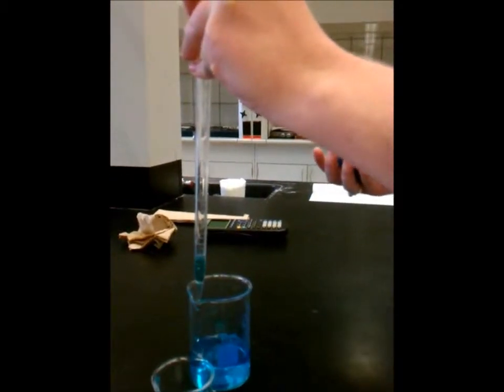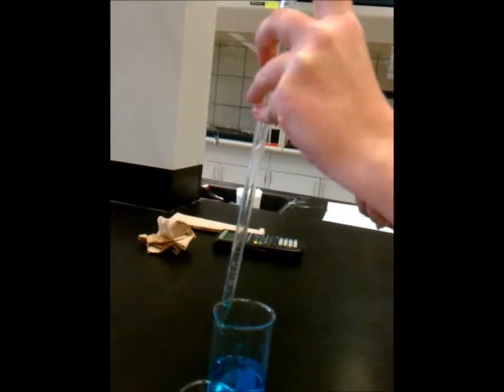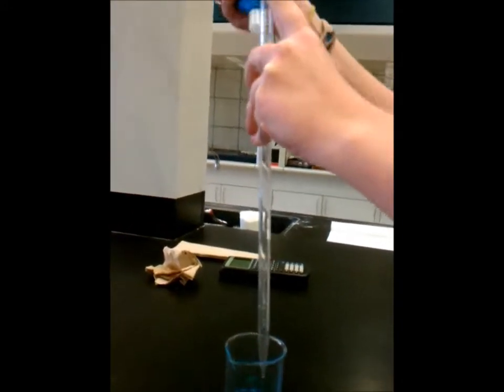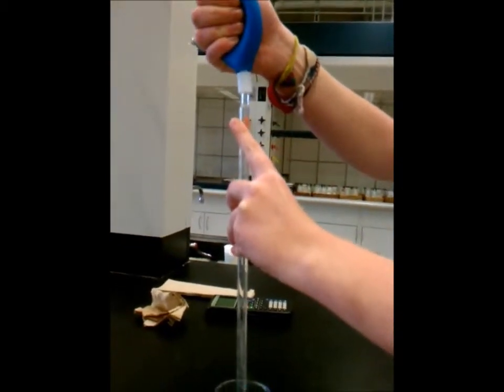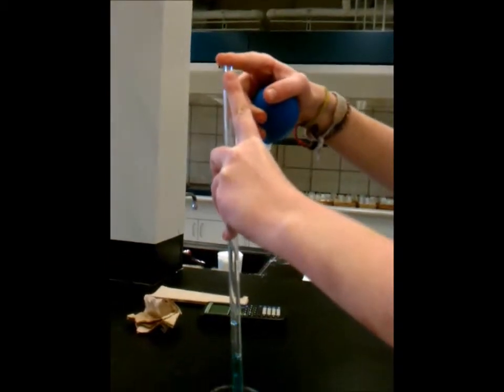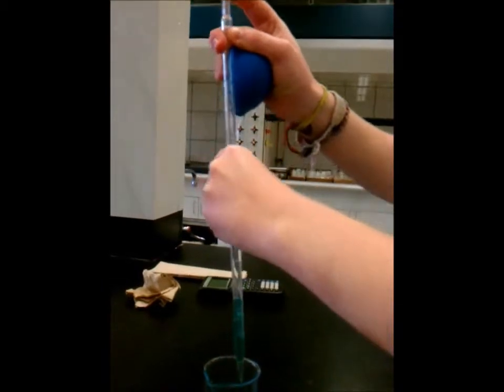And you want to make sure you place it on the side of the beaker to ensure that you don't get any splashing or anything. Alright, so again, squeeze the bulb, squeeze the water. And then now we're going to read the initial reading.